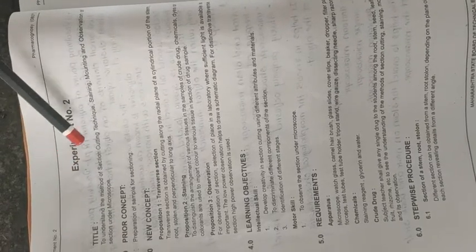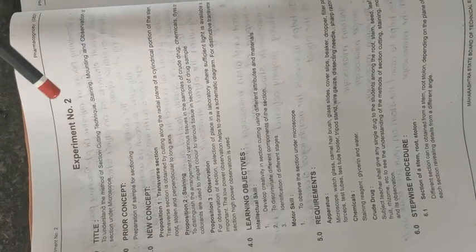Hello everyone. After the first experiment comes experiment number 2, which is to understand the method of section cutting technique, staining, mounting and observation of a section under the microscope.